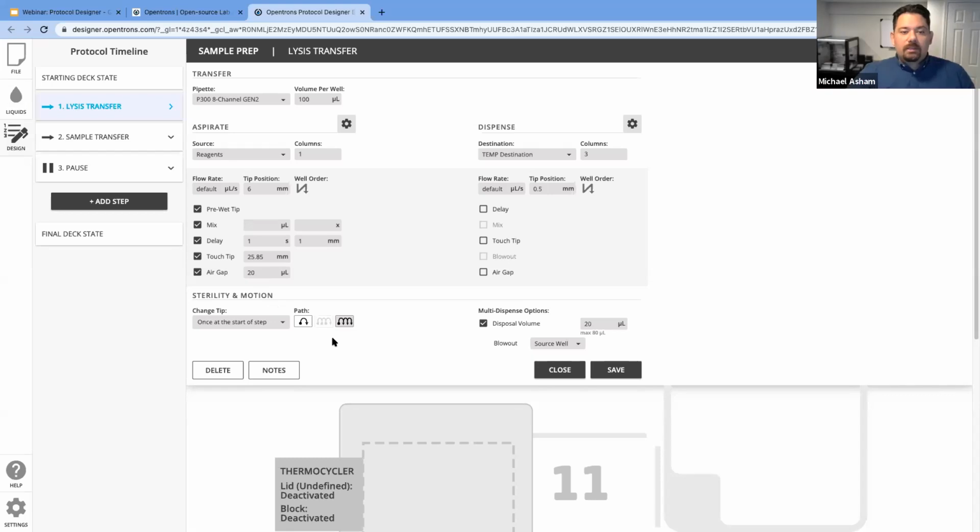All right. Can you ask the OT2 to aspirate from a column that has got some wells that do not contain liquid? And how would you change the Z heights on that labware choice?